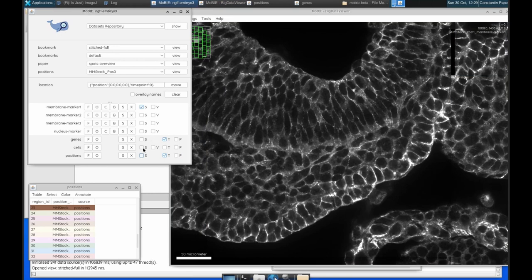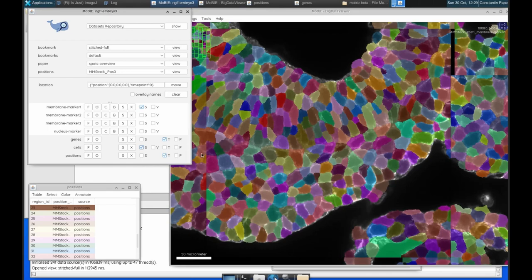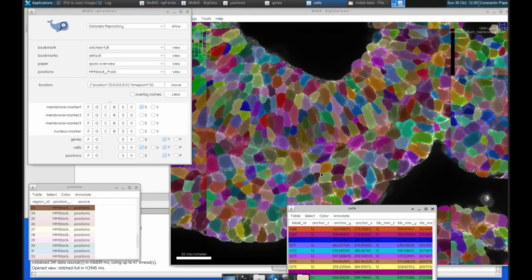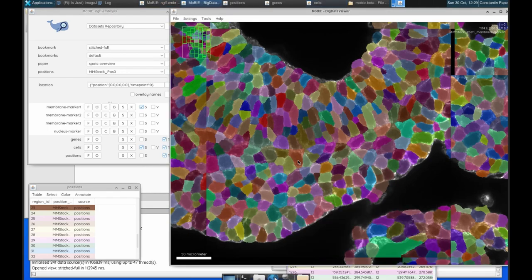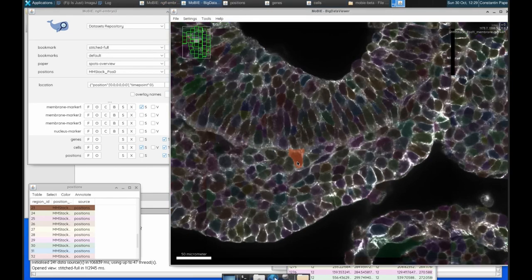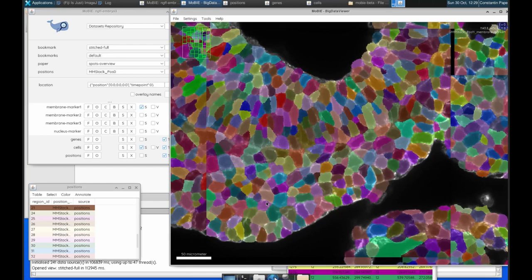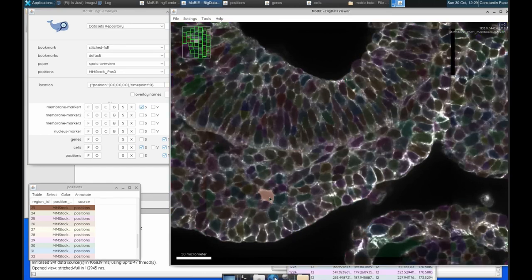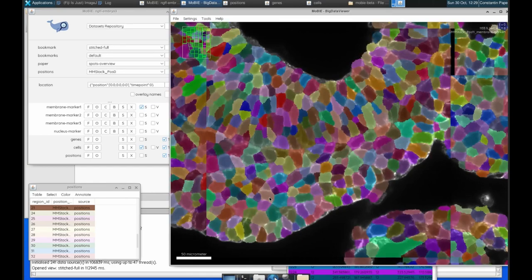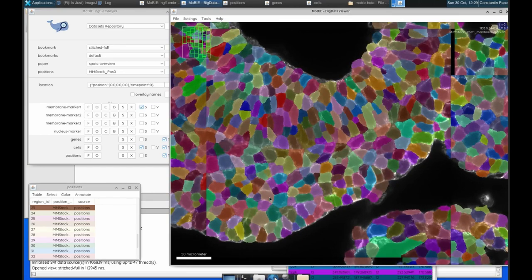We also have this cells layer, and these are segmented cells that have been segmented based on those membranes that we were just looking at. And we can select particular cells and look at them like that.